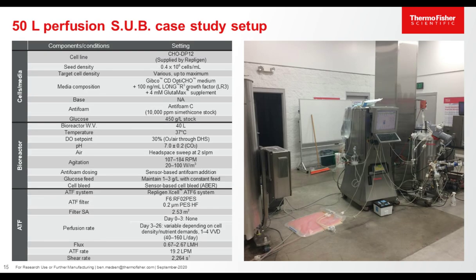I'll quickly go over a case study we performed in our lab using these design changes. And I apologize up front for the condition of our R&D lab in this photo, but simply point out that the ability of the SUB to be used in even gray space areas is valuable, even if you've got brooms and garbage cans sitting around like you can see in this picture.